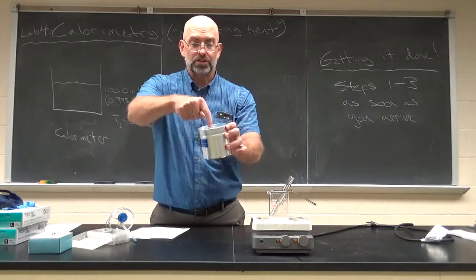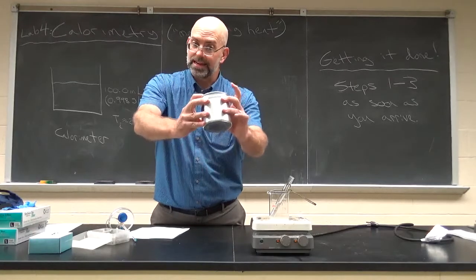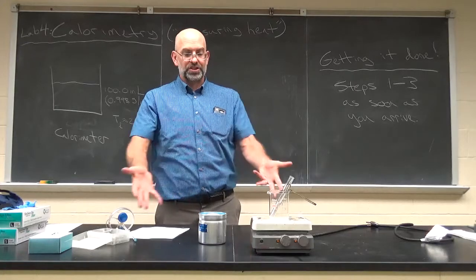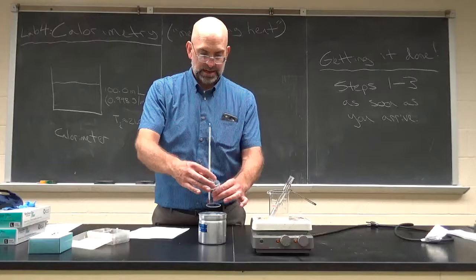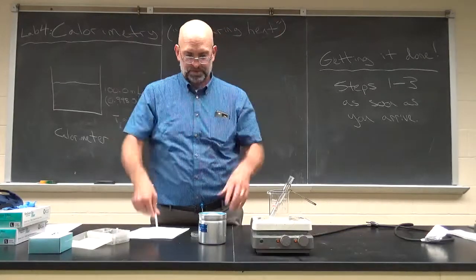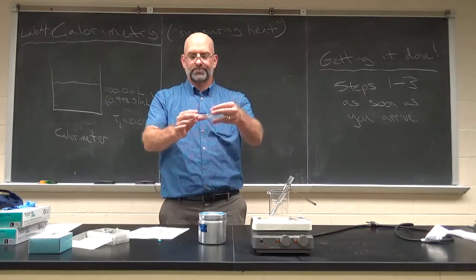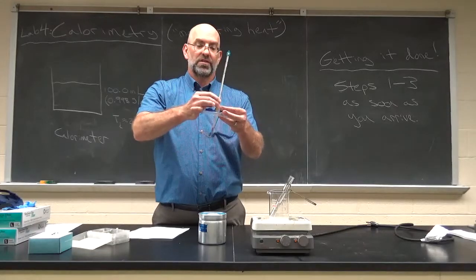And then we actually can do the experiment right in here. So this little container is pretty well insulated. So you can actually just use that by itself rather than 2 coffee cups. Or if we want to, we can put this lid on top, just to be a little careful. This thing, see what I mean? It's plastic. Too much coffee this morning. This thermometer has a stopper on it, so it sits in there.